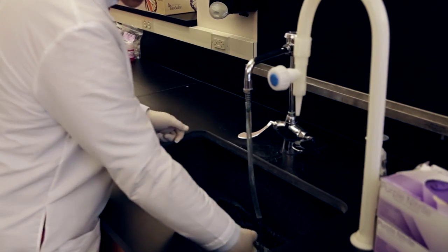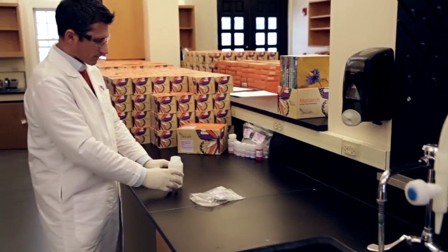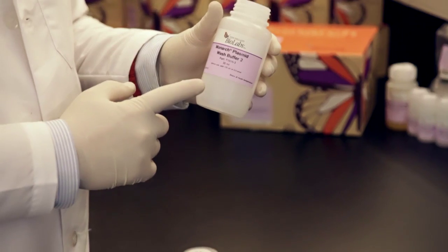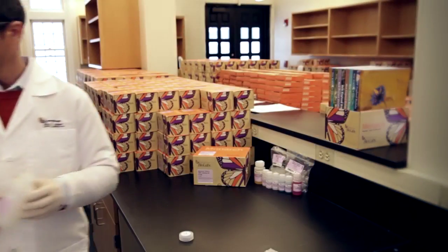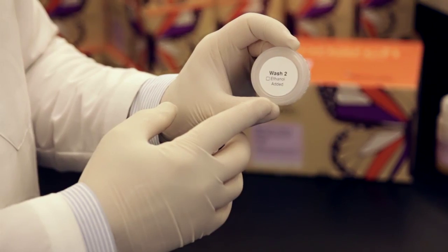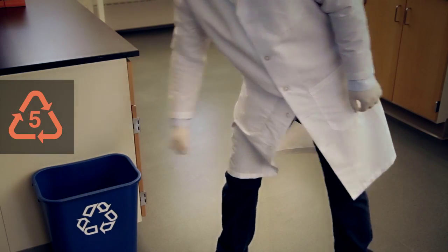When designing the Monarch kits, we chose buffer bottles that are lighter weight and recyclable. If your facility does not offer single stream recycling, you'll want to separate the bottle from the cap. The Monarch buffer bottles are made from HDPE and compatible with any recycling that is marked with recycling symbol number two. The caps, on the other hand, are made from polypropylene and should be placed in containers marked with the recycling symbol number five.